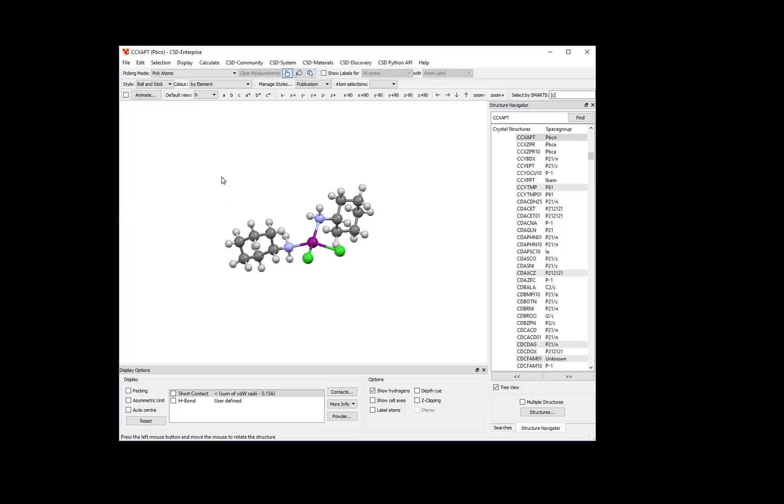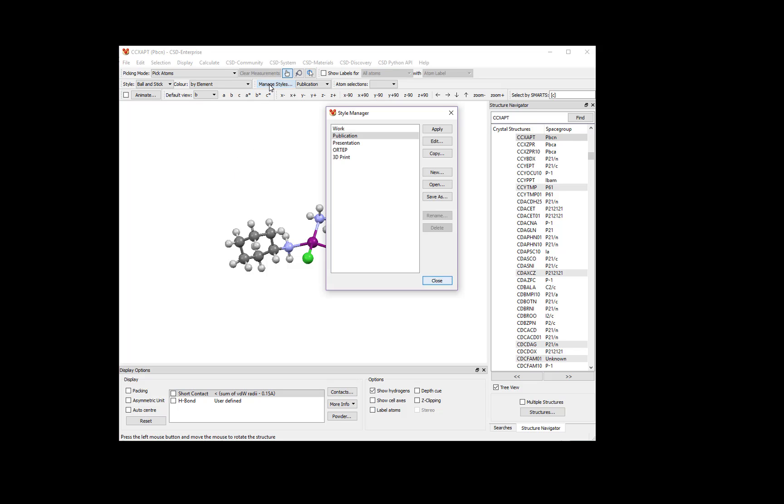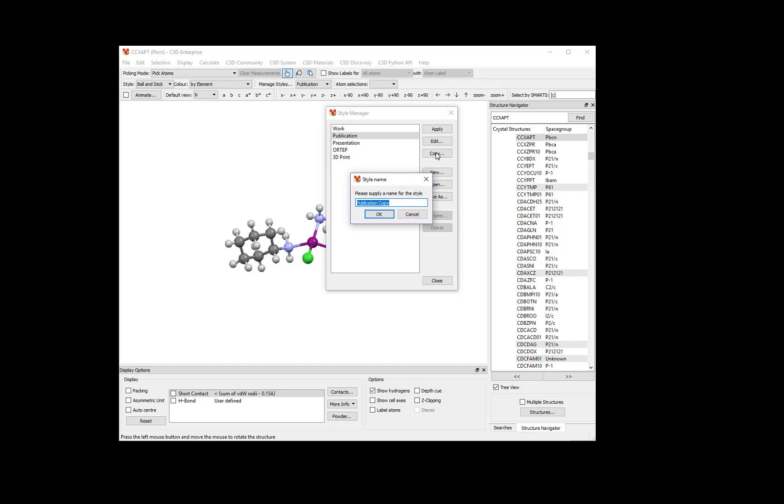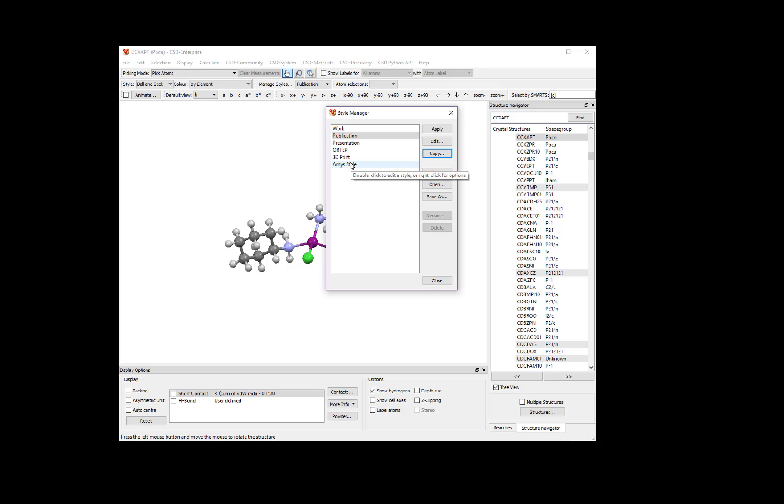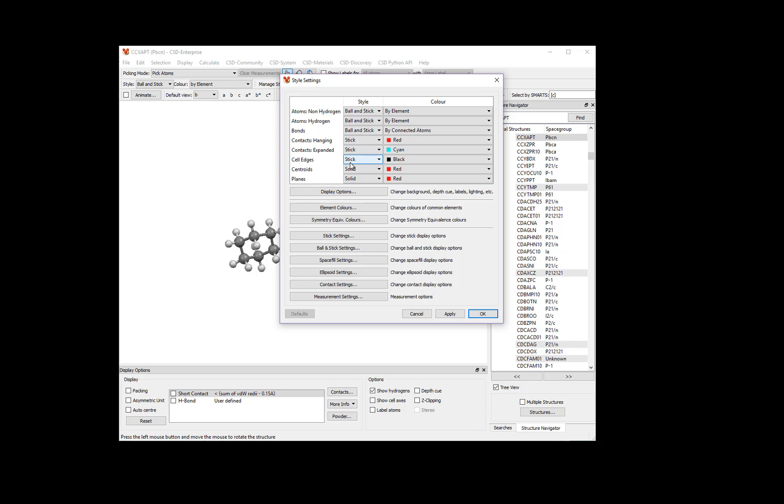If you want to create your own style type, you can access the Style Manager dialog by clicking on the Manage Styles button. An easy way to get started is to copy an existing style and edit it. Click the Publication style and then click Copy. Enter a name for your style in the dialog box. Click OK when you're done. Now choose your style from the Style Manager and double-click it. This will bring up the Style Setting dialog.